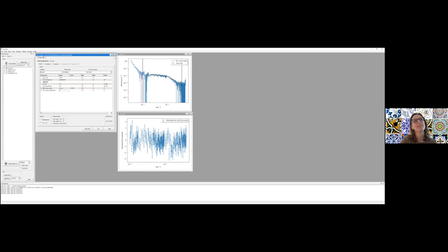So we have an okay fit for a form factor. Now the residuals that you see here at the bottom, like I told you, they're just a difference between the fit and your data. They're plotted in terms of number of standard deviations away from the mean, and you don't want them to be much larger than plus or minus 3 standard deviations. Okay, so this looks kind of normal. That's what you would expect pretty much.